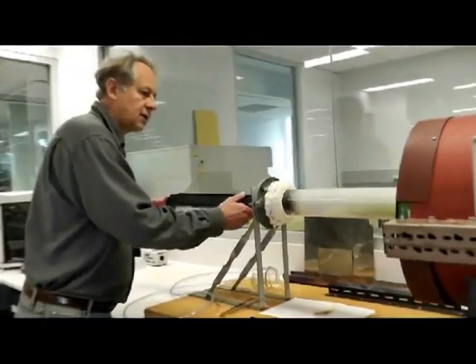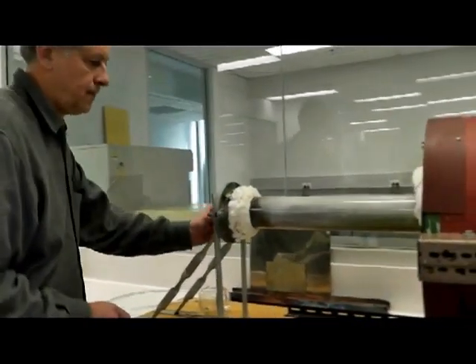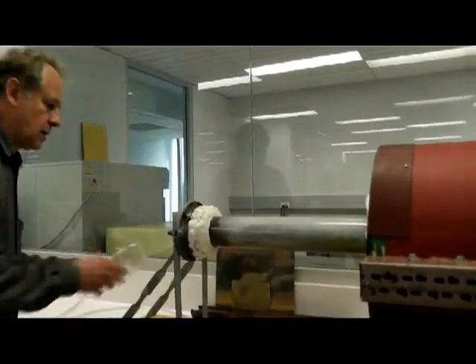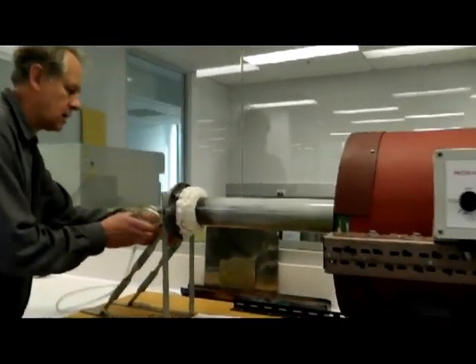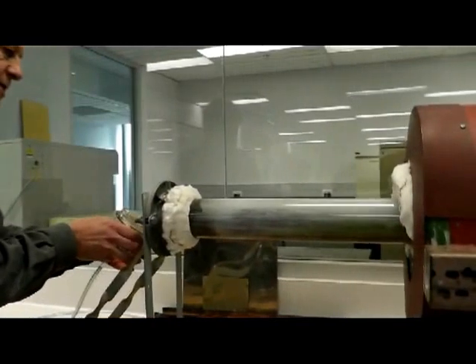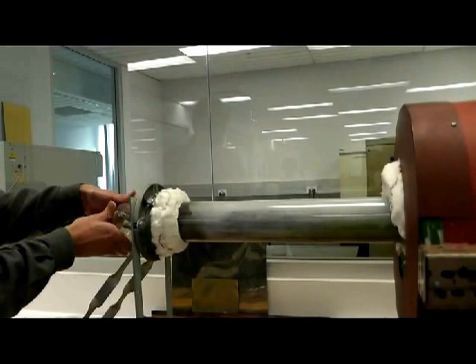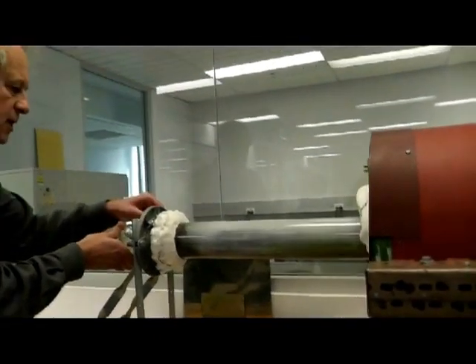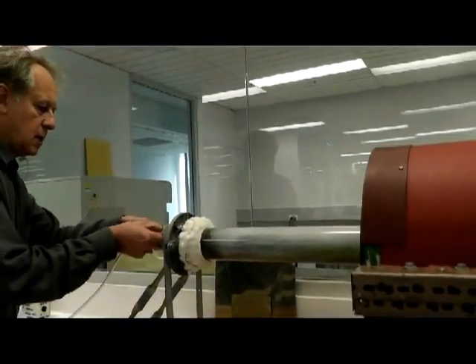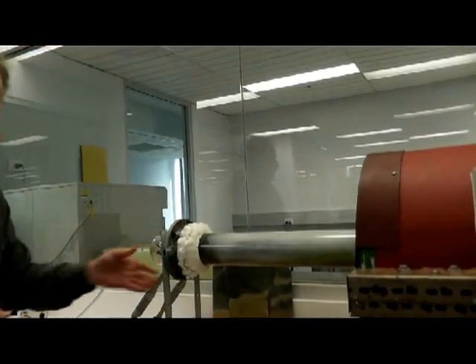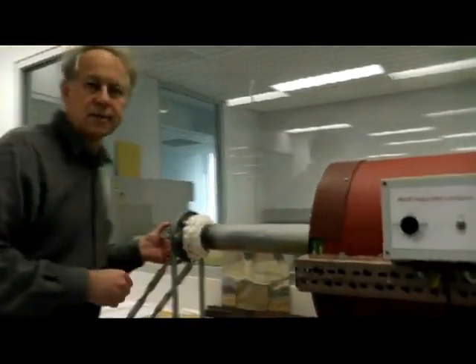Insert it into the reactor, into the fixed bed reactor, which is sealed up and we introduce a gas supply which oxidizes and also acts as a carrier to transfer the products of the combustion to the analytical system.